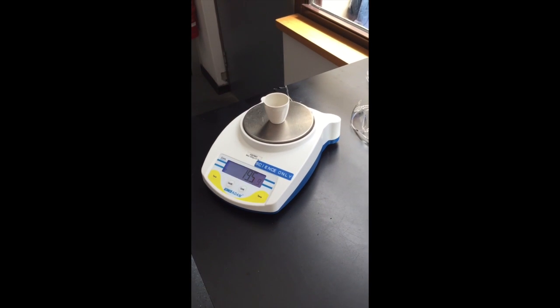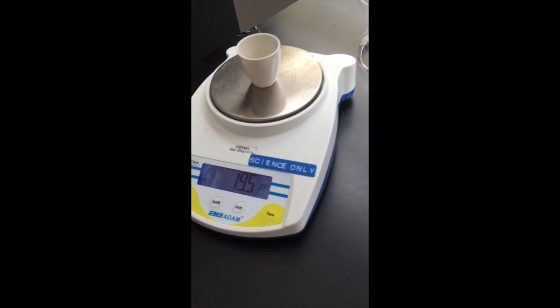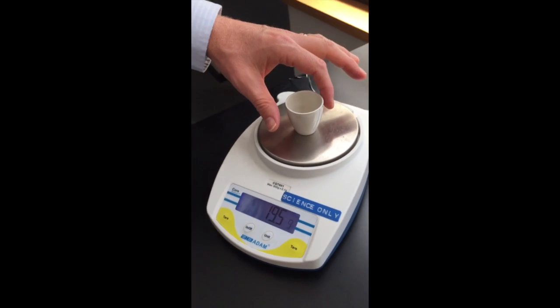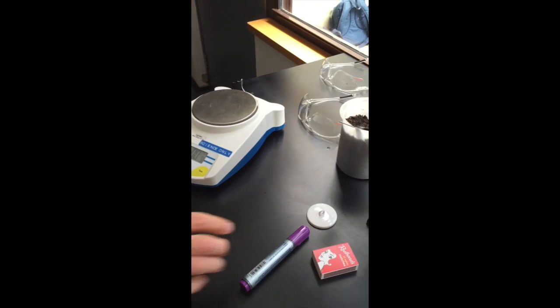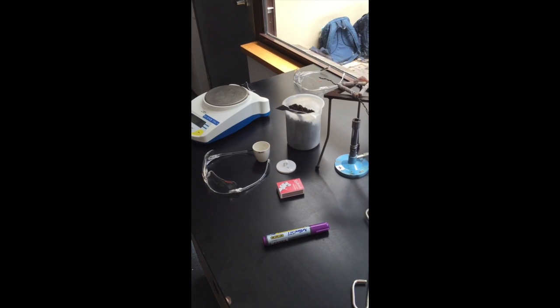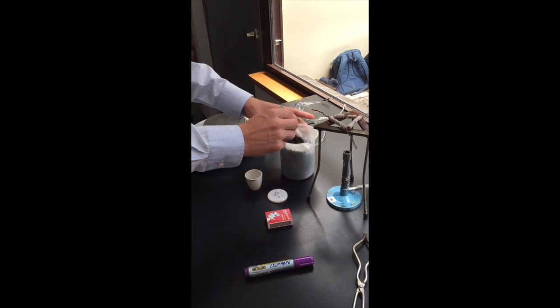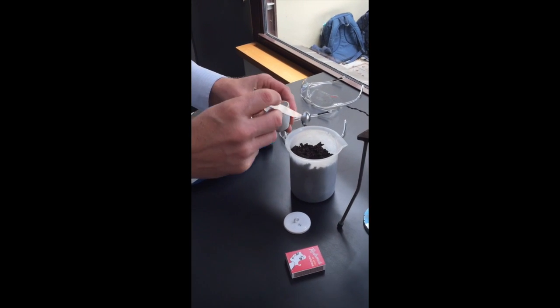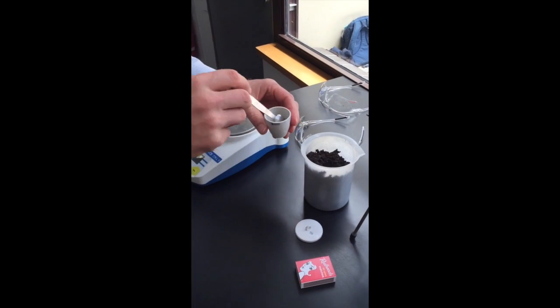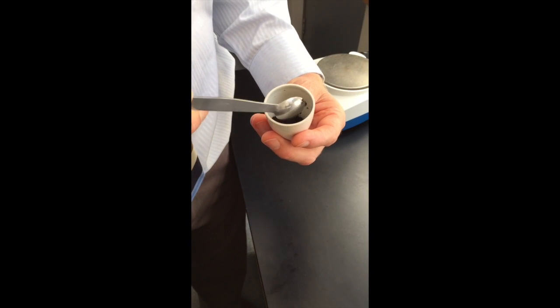In this experiment we're testing the amount of moisture content in soil. To do that we need to use a crucible, but we need to make sure we weigh the crucible first before we add the soil. Once weighed, get two spatula fulls of soil and place them inside the crucible, then sort through and pull out any sticks or bark so that you're left with just the soil.